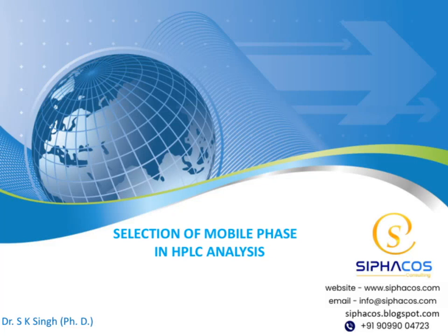I am Dr. S.K. Singh, and I'm excited to present to you on the topic Selection of Mobile Phase in HPLC Analysis. Today, we will explore how choosing the right mobile phase is crucial for effective HPLC analysis. We'll cover the key factors involved and some practical considerations. So, let's get started and delve into this important aspect of chromatographic techniques.